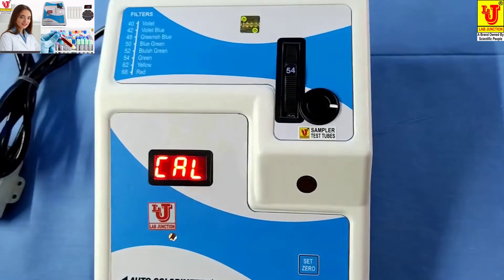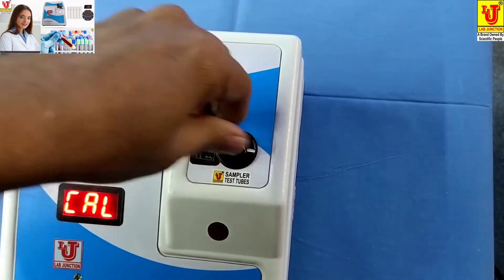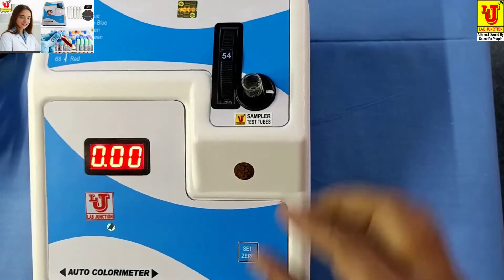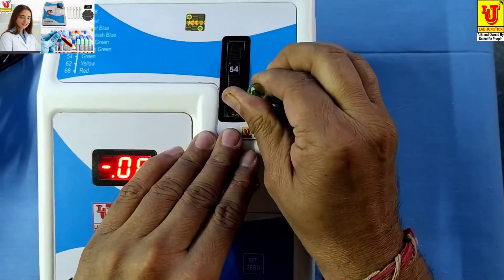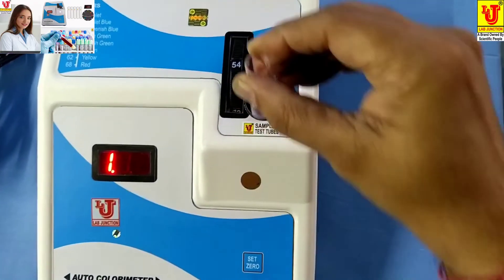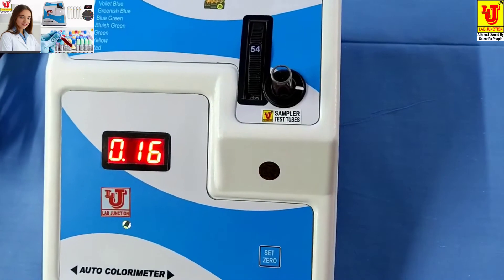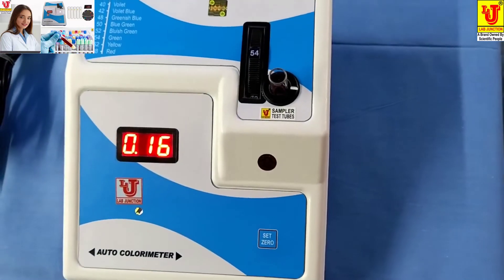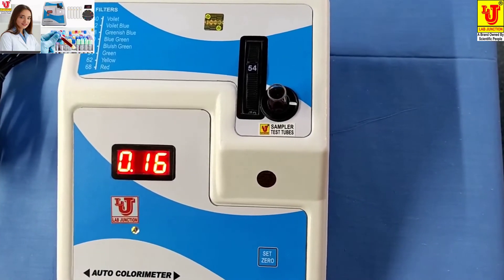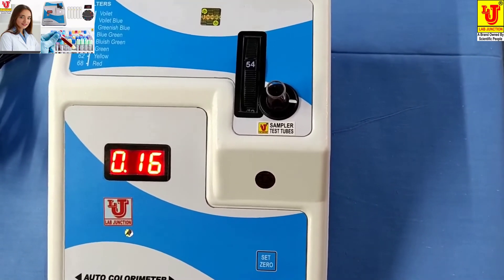First, insert the blank like this. Set to zero — zero is displayed. Then remove your blank from the test tube holder and insert your sample. This gives your result in absorbance, or optical density. For glucose, you can do the calculation as per your reagent manual.